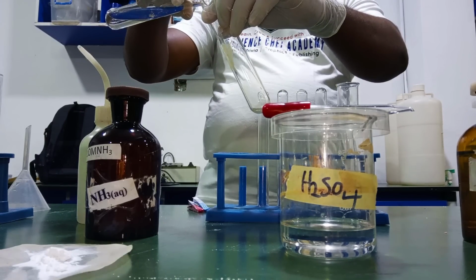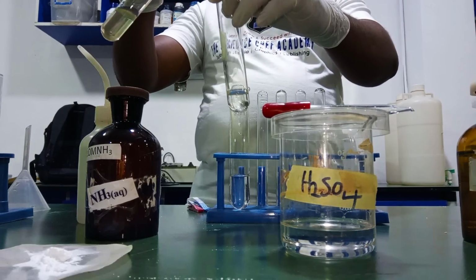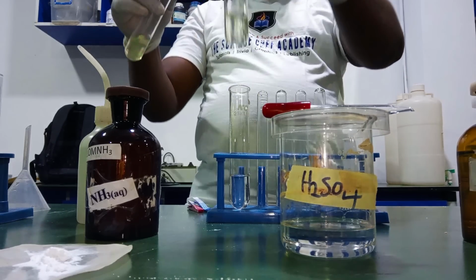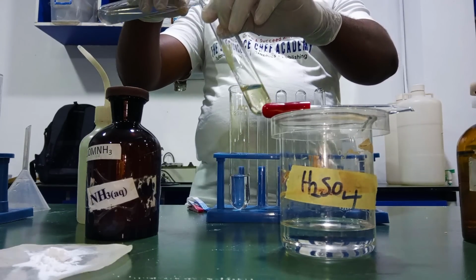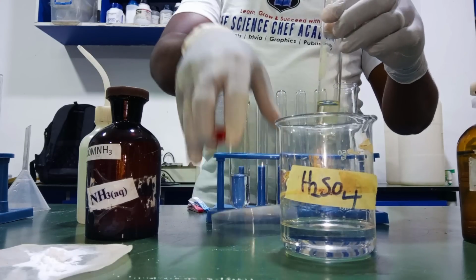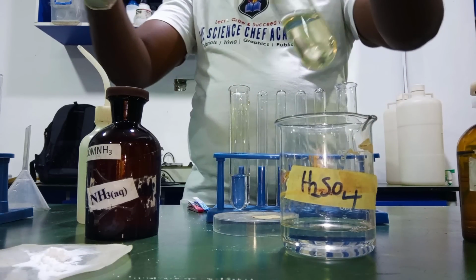So you have a portion of the filtrate, and then we add a portion of the freshly prepared iron(II) sulfate, right? And then, using a drop pipette, we will add the concentrated H2SO4. You have to be very, very careful here.